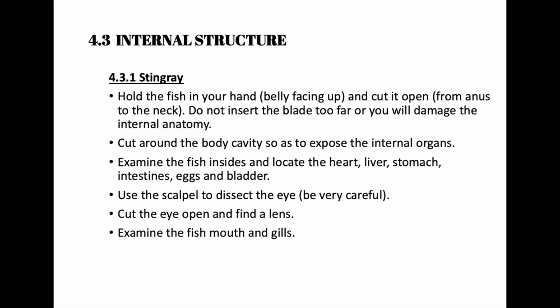Use the scalpel to dissect the eyes. Be very careful. Cut the eyes open and find a lens. Examine the fish mouth and gill.